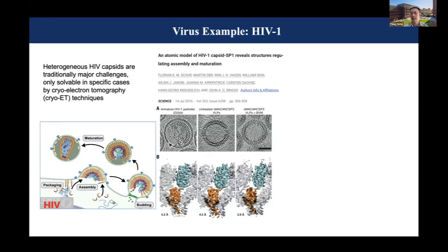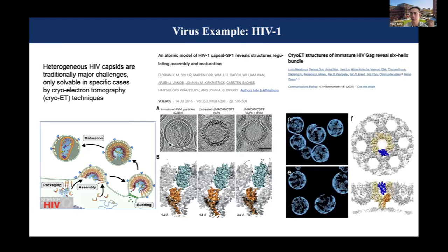Okay, this is really why cryo-ET has to be done. This is a work shown in Peijun Zhang's lab, really highlighting the issue. On the left, C and E, you see the capsid mapped into the data. In this illustration, you can see that although they all look spherical, they have different sizes and they're broken. So that's why you have to deal with each particle individually. You cannot say the two particles are the same. You cannot average them. You can only do sub-regions with sub-tomogram averaging.